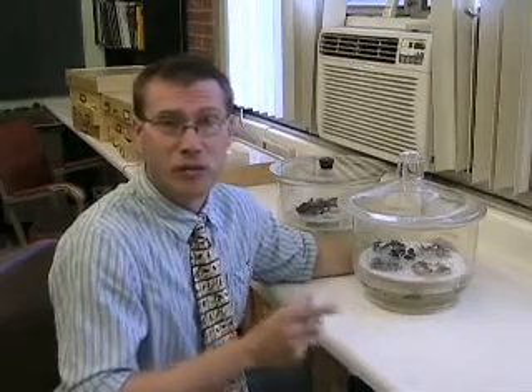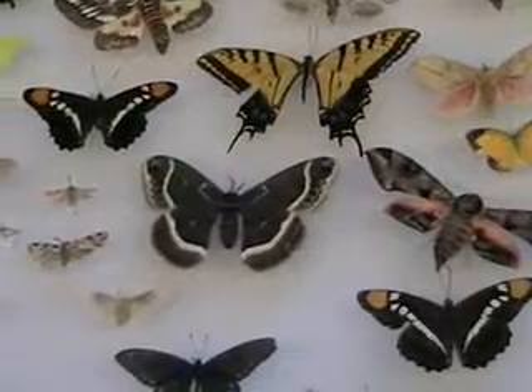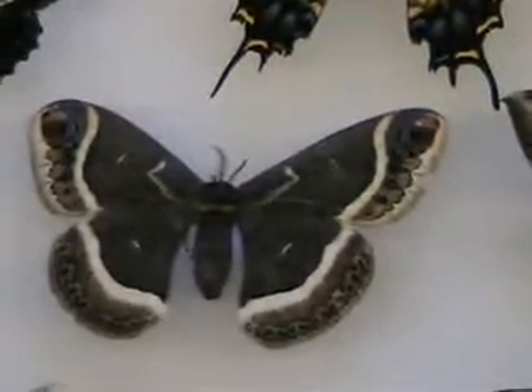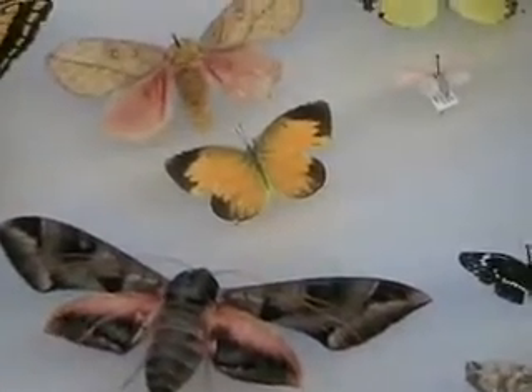After the insects have died, you take them out of the freezer, and sometimes insects can be really dry and brittle. For example, Lepidoptera — moths and butterflies. If they are not soft when you try to spread the wings, they can crack and break, kind of like old leaves or crackers.